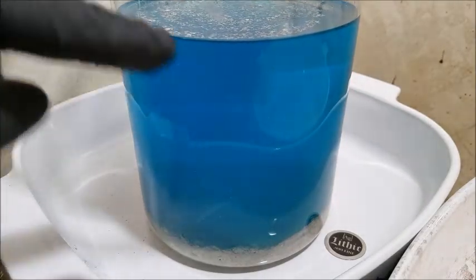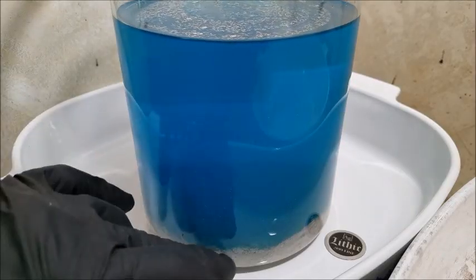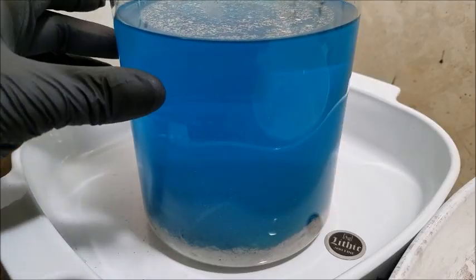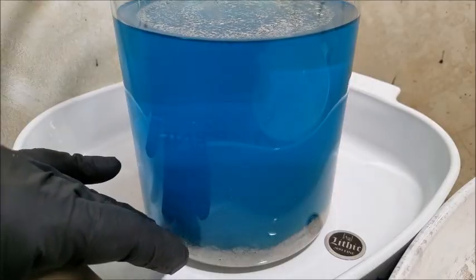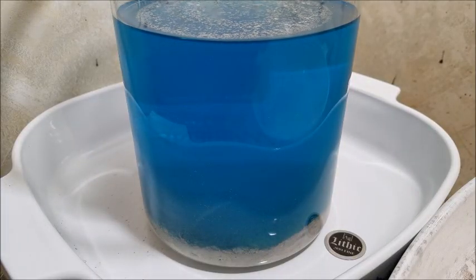I'm actually going to swirl that around a little bit more and let this sit overnight. Any copper that did deposit with the silver will be drawn back out into solution, pulled by the silver through the exchanging of ions. So tomorrow when I filter this out, I'll have very pure, clean silver — 99 plus percent.